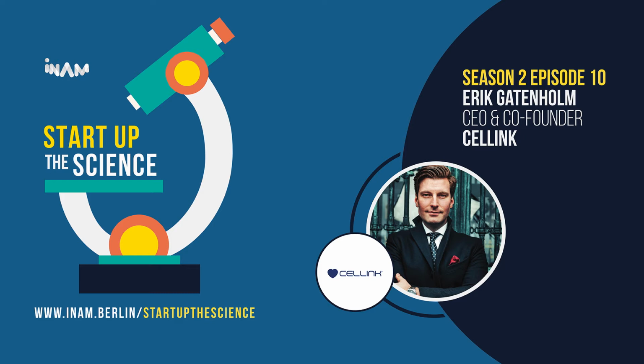So printing them in a very cell-friendly way so the cells survive, and then also using a material that you embed these cells in so that they will feel at home. Because when you just print the cells using a regular paper printer, for instance, they're not placed in an environment in which they feel at home, like in the human body. So that's the basis behind the entire industry.